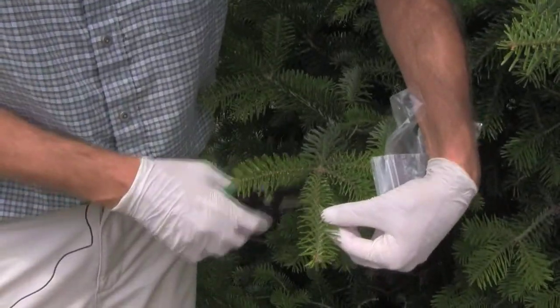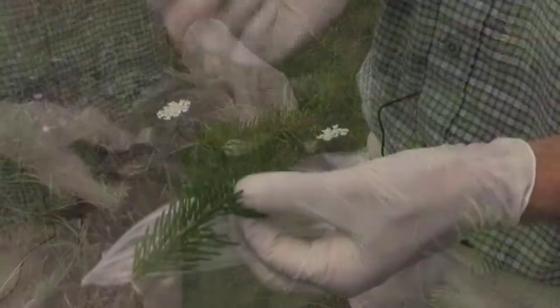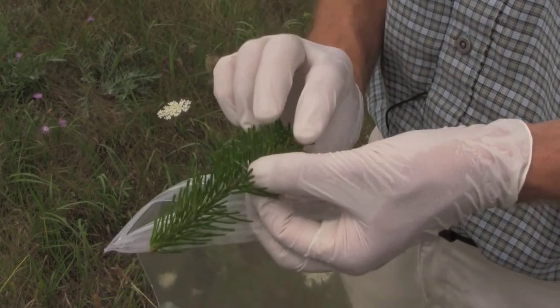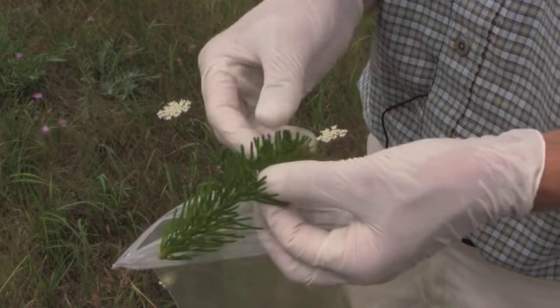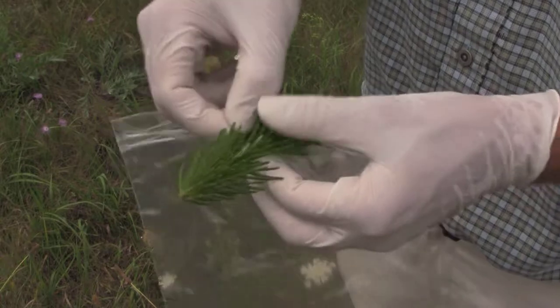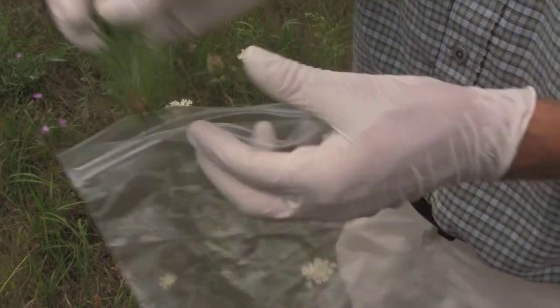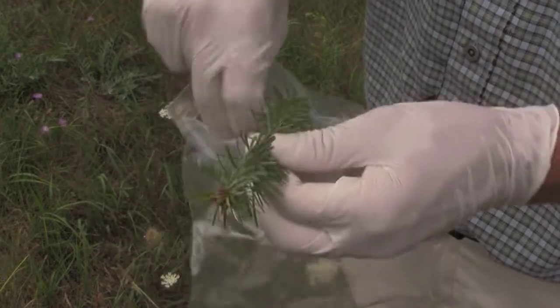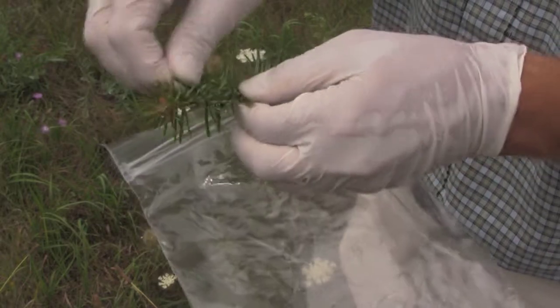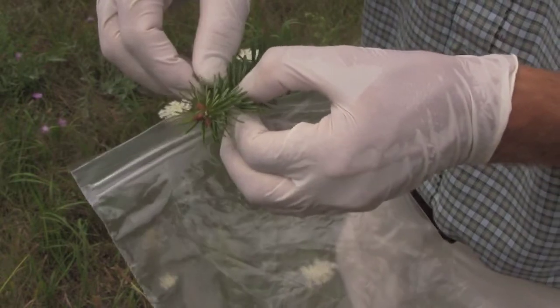You want to collect this amount of the shoot — just come in with your clippers and clip the foliage. Then take a range of needles: don't collect them all from the very tip or all from the base. You can usually just pluck them off, taking care to avoid getting bark in the sample.